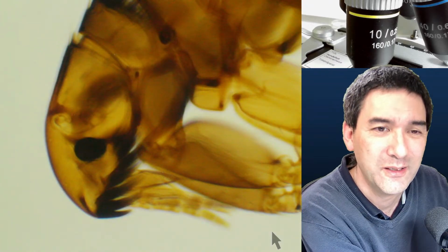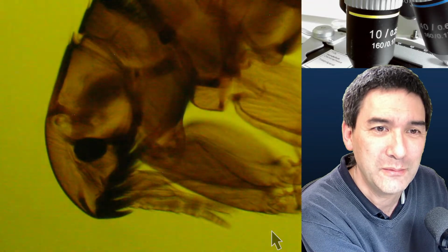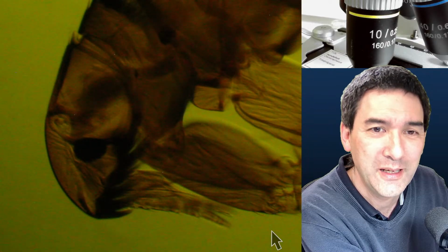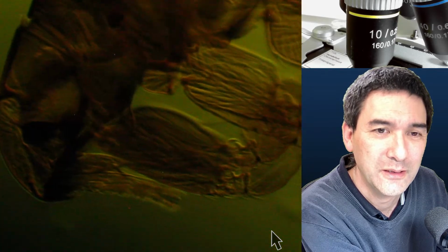It does look a little bit soft because the condenser is open. But now I'm rotating the filter into position again. Here we go. A little bit oblique now.